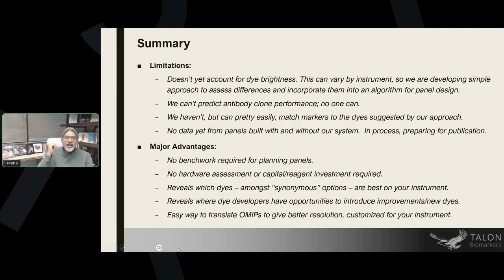stain out CD4 on cells or on beads using the same clone on different dyes, and that we build out different panels and look at their spreading error. And that will really tell us a lot about whether this system is working or not.